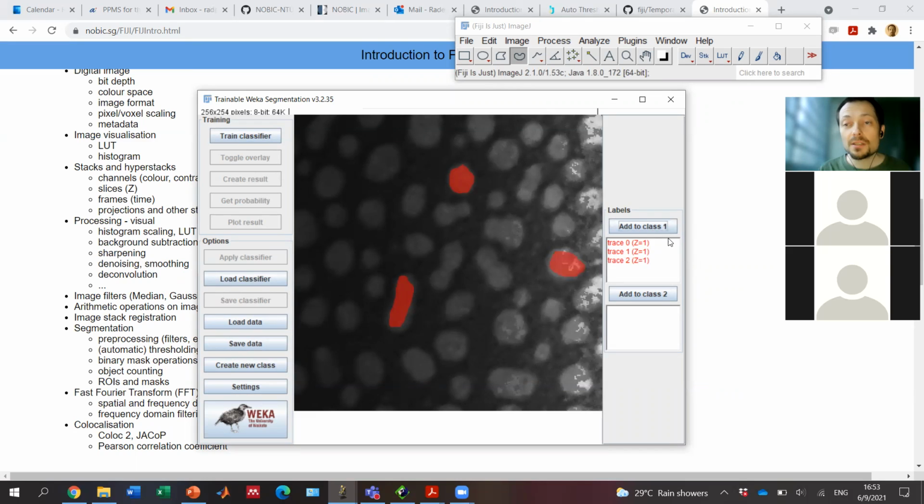Obviously, this training is quite a lot of work because I need to somehow segment here. Either I can use some automatics, maybe I could make an image with some automatic segmentation. Otherwise, I have to segment it manually.